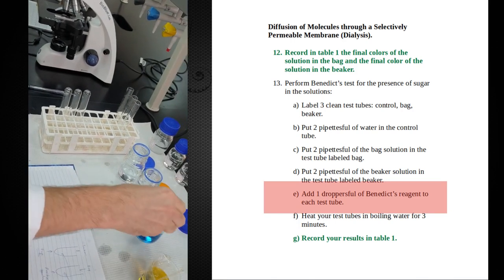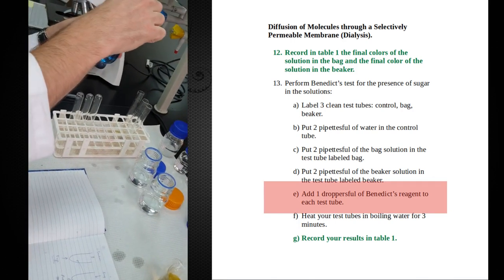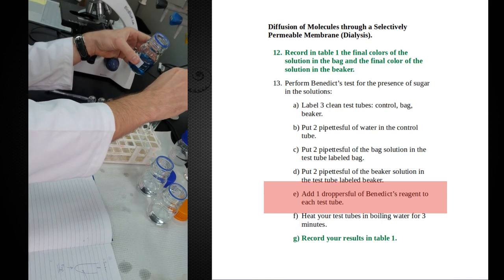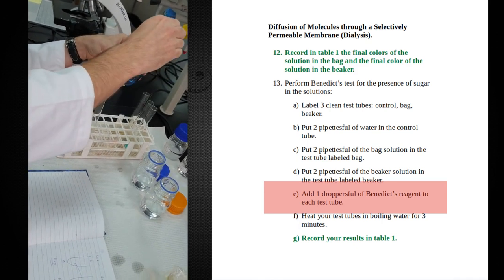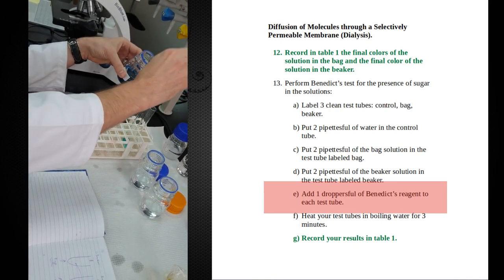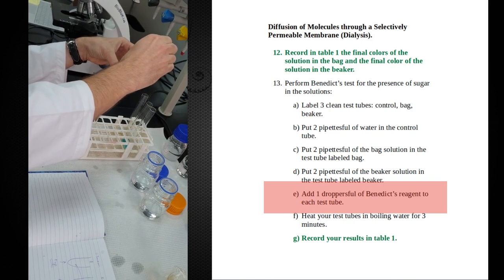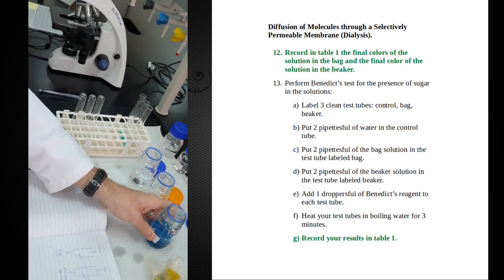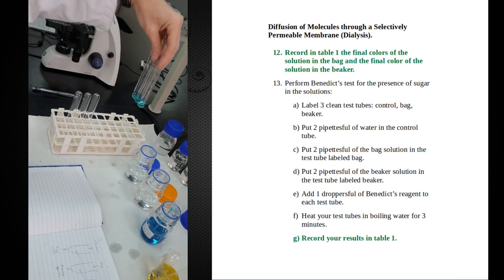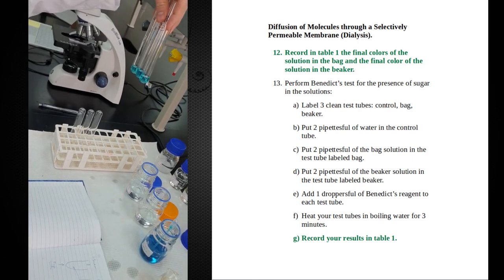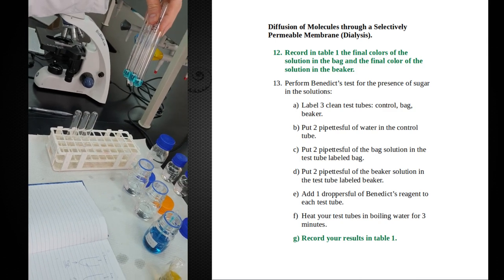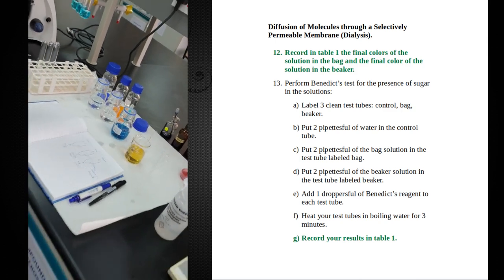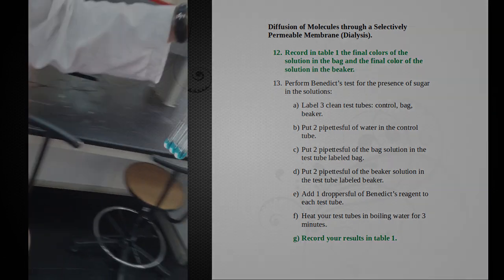Now, Benedict's reagent. Let's just do a pipetful of this into each of these. And the amount of Benedict's reagent is our control variable, so we want to make sure that all of them get the same amount. So now we have three test tubes that look pretty much the same. But again, we have to cook these before we can get our results. So let's put them into the water bath for a few minutes, and we'll see our final results.